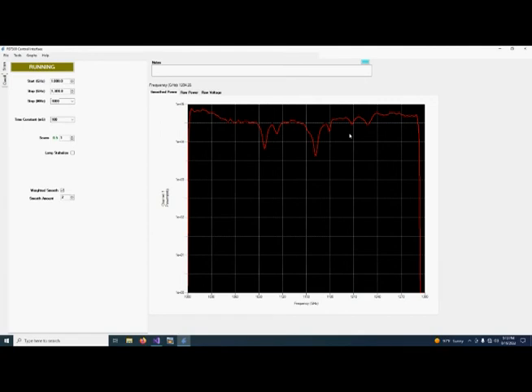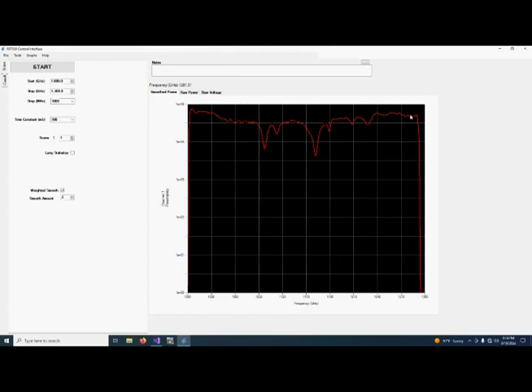But because we're adding the first and second harmonics, we get a nice smooth summation with our water lines clearly visible and much better signal to noise ratio. We can even start to see some of the smaller water lines that were invisible previously.